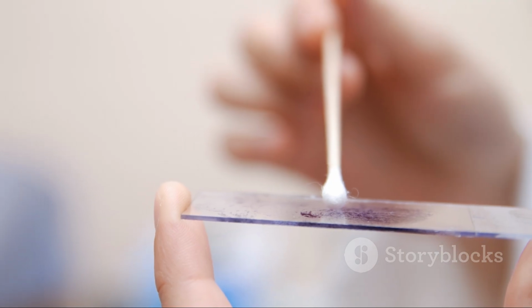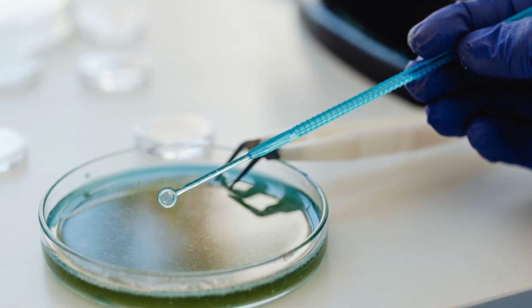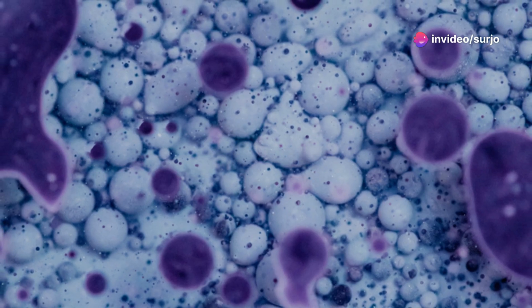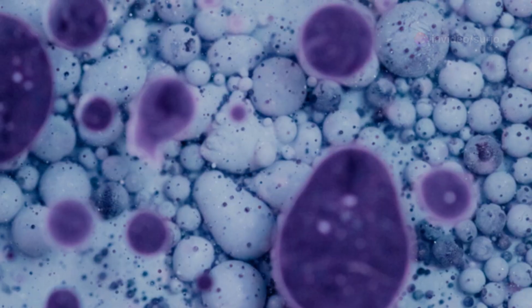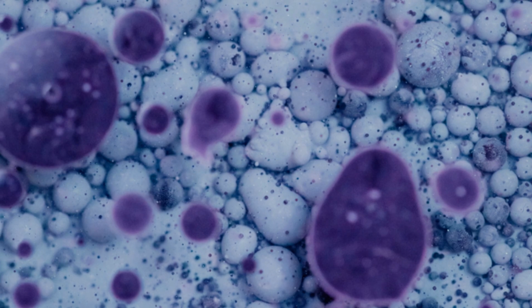The process begins by flooding a heat-fixed bacterial smear with crystal violet, a purple dye that stains all cells purple. This initial staining step ensures that both Gram-positive and Gram-negative bacteria absorb the dye, setting the stage for differentiation based on their ability to retain it.